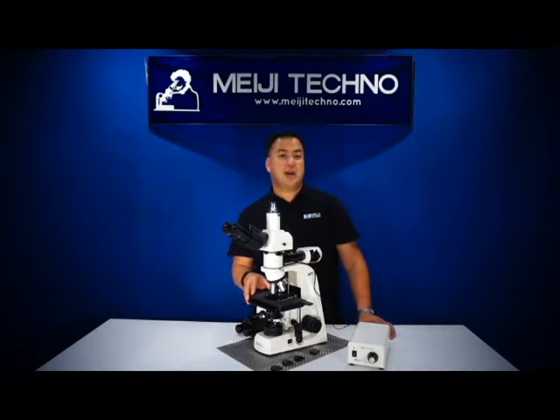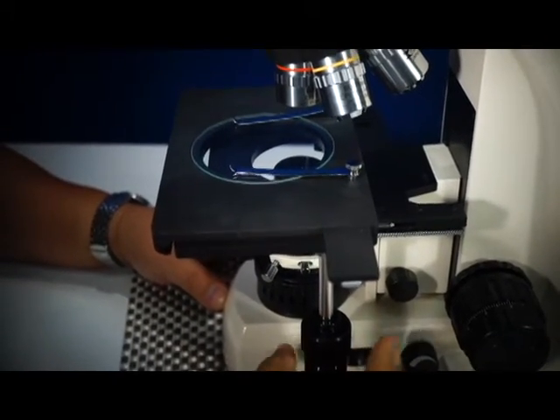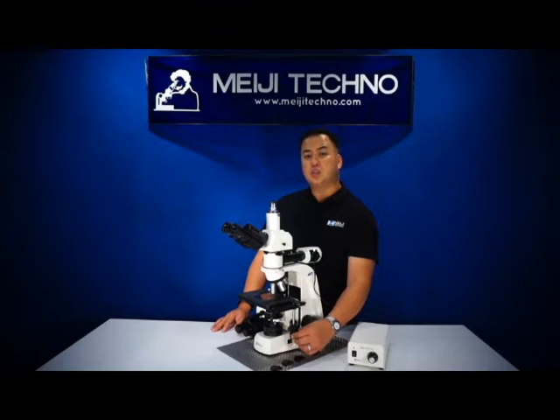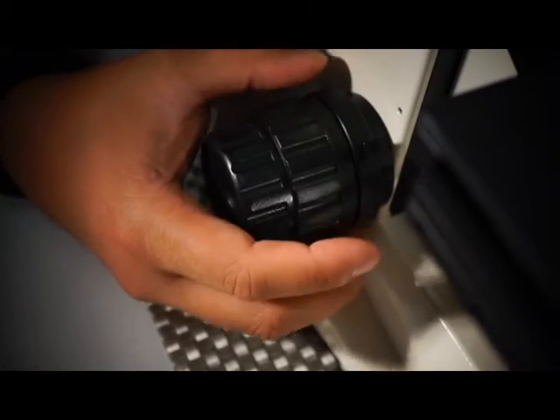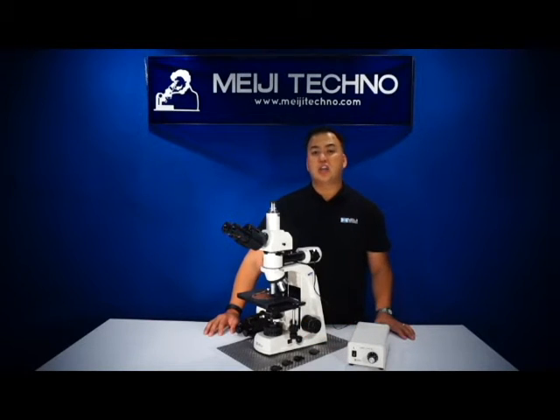The MT-8000 has a large 191 millimeter by 126 millimeter ceramic-coated stage with stage clips and a 4-inch by 4-inch travel distance. With its ergonomic XY coaxial control, it gives users free range to move the stage comfortably and accurately. It also has a stage lock to prevent the sample from hitting your objective, and a tension adjustment knob so you can increase or decrease the feel of the rotation.